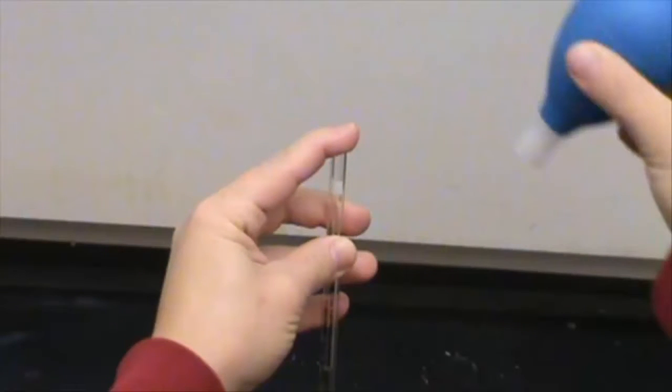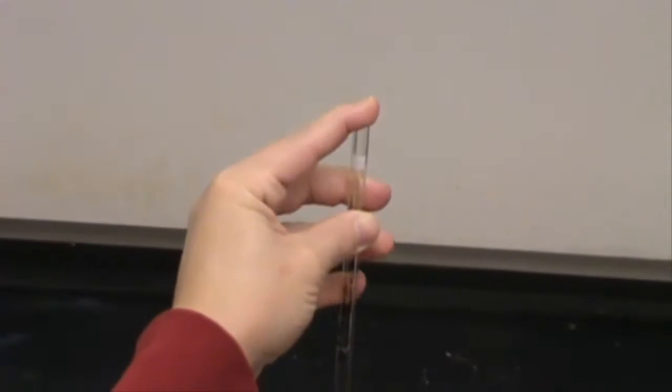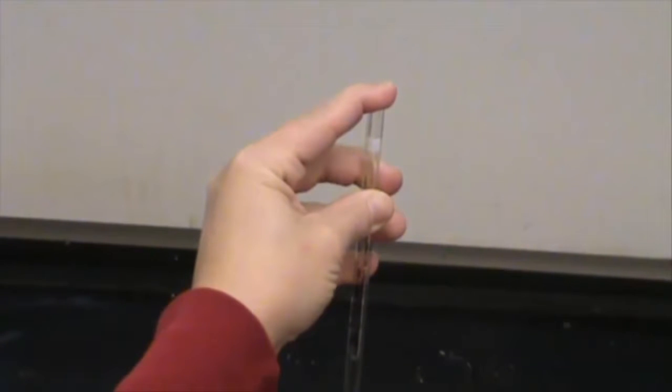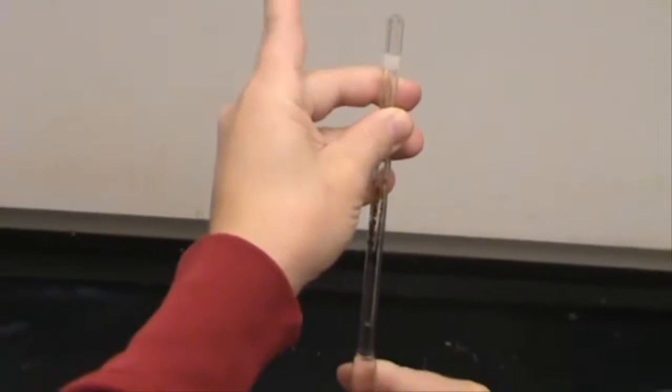Quickly take the bulb off of the pipette and put your finger over the top of the pipette hole. Take a look at this again. This is usually the most frustrating part. Take the pipette out of the water and carefully allow some of the water to leave the pipette until the meniscus reaches the 5.00 milliliter fill line. Take your finger off of the hole to dispense the liquid.